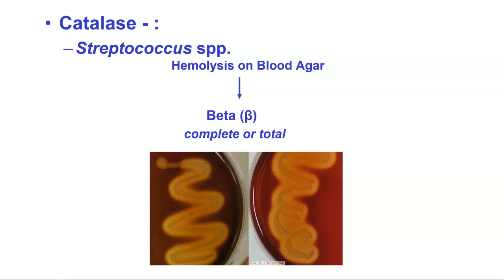The way to observe this effect is to illuminate the plate from behind. Then look at where the colony and the bacteria are growing and observe the edge. It is along the edge that changes can be observed. With beta hemolysis, there is a distinct zone of clearing around the colony. The agar will appear transparent. You can see through it. Anything on the background will be able to be seen. This is a result of complete hemolysis, or beta hemolysis, of the red blood cells in the agar.